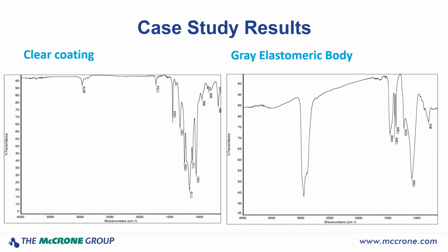After we have obtained our spectra, we can see that the two portions of the particle provide very different infrared spectra. If we take a closer look, we can confirm that no peaks from one spectrum are present in the other. So the two components were cleanly separated. So we can go ahead and start working to identify each part.